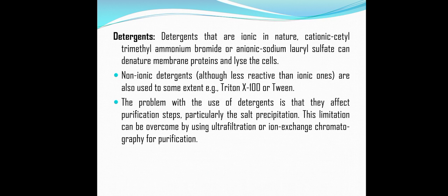The next one is the use of detergents. These detergents are ionic in nature, that is cationic cetyl trimethyl ammonium bromide or anionic sodium lauryl sulfate. These can denature the membrane proteins and lyse the cells. The main activity of these quaternary ammonium salts or detergents is to denature the membrane proteins, and whenever there is denaturation of membrane proteins, the cells get lysed.